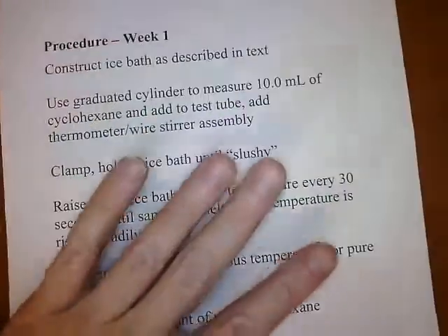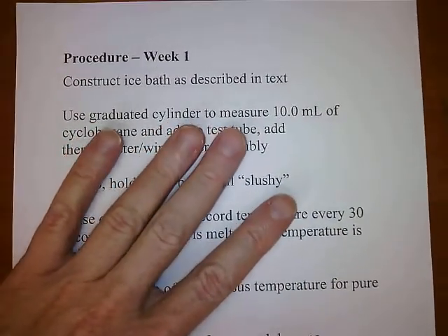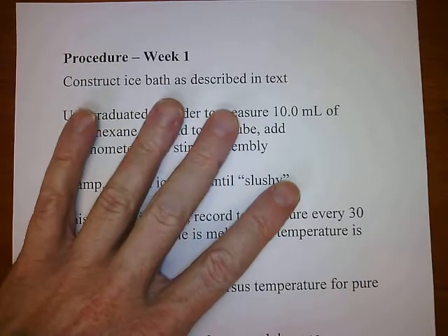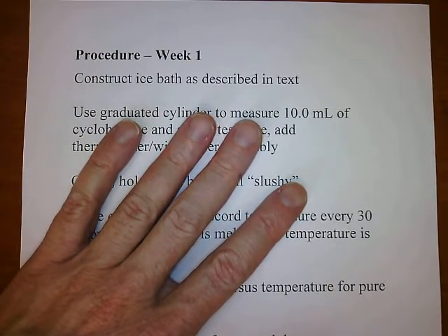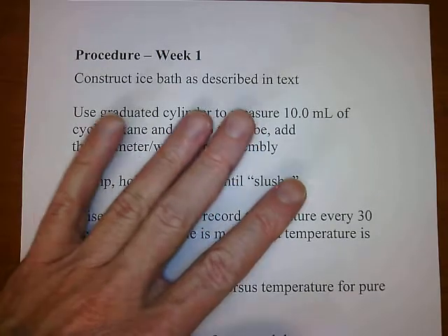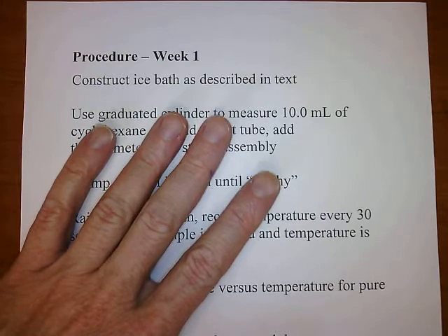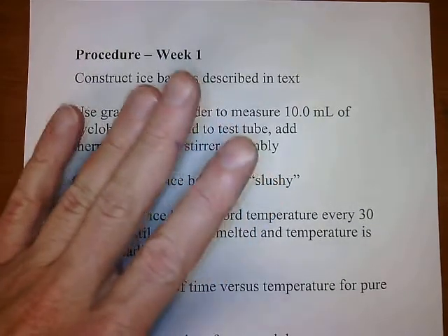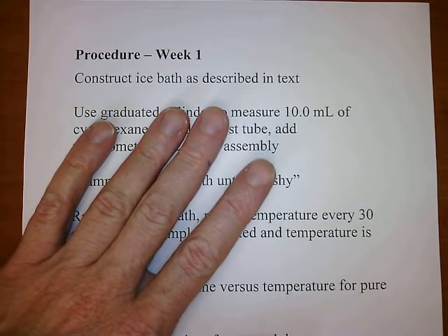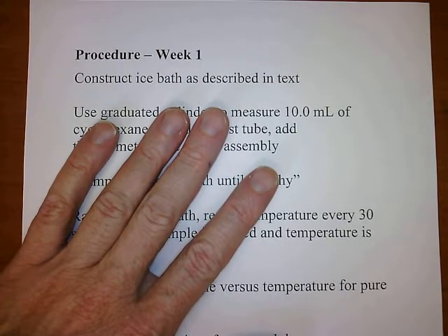Okay? So what are you going to do in the first week? The first week is just going to be pure cyclohexane. You're going to construct a heating curve for pure cyclohexane. So you'll construct the ice bath as described in the text. It's basically ice and salt. We have to use the salt to get the temperature down as low as we can.